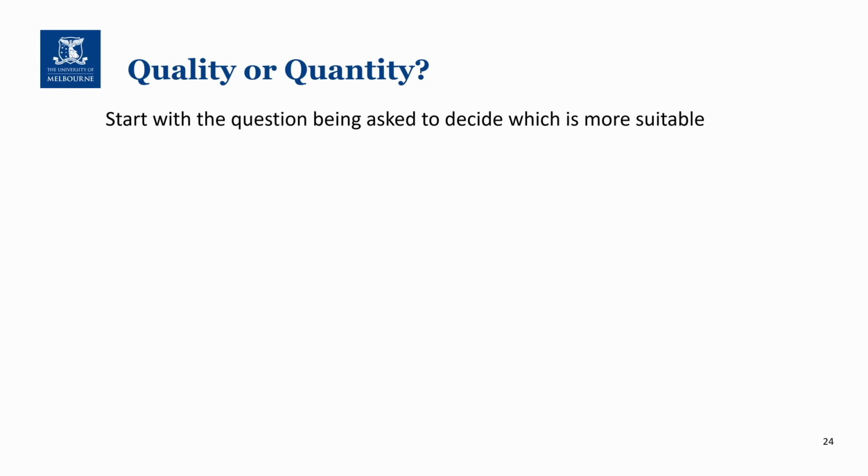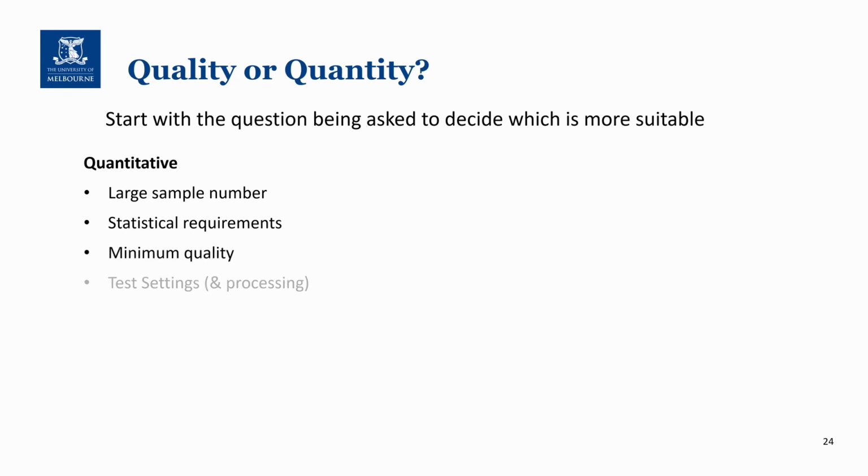The quantitative approach focuses more on generating a large number of images. This may be because there's a large number of samples or because of statistical requirements where you want to be able to be confident in your results. From an imaging perspective, what we want to focus on here is the minimum quality required. And you should always test the settings and the processing before beginning imaging a large number of samples.